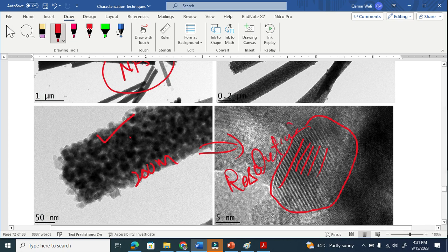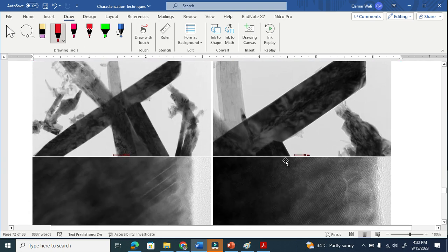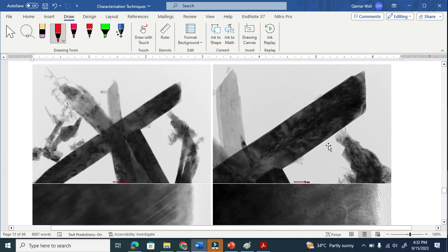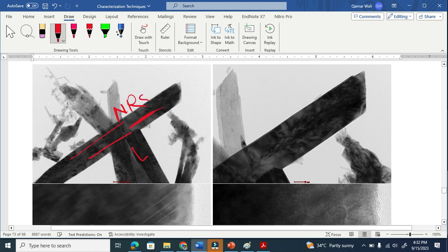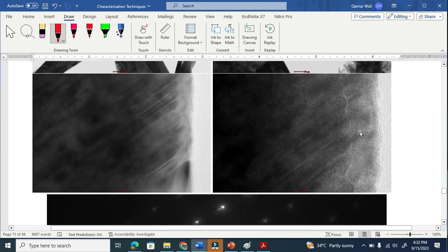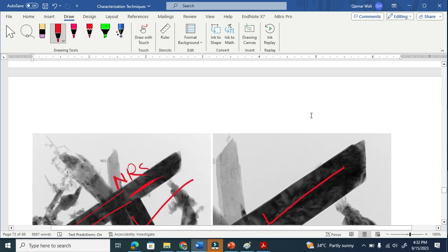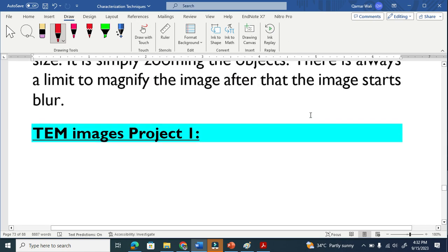Similarly, this is a single crystalline material — basically nano rods. This is low magnification, and when we zoom in we get this, and when we further zoom here you can see the planes clearly. This is a single crystal — you can see separate planes here. So this is how we define resolution.